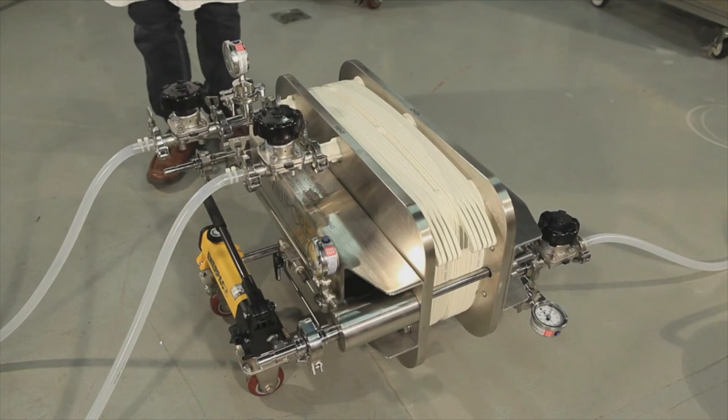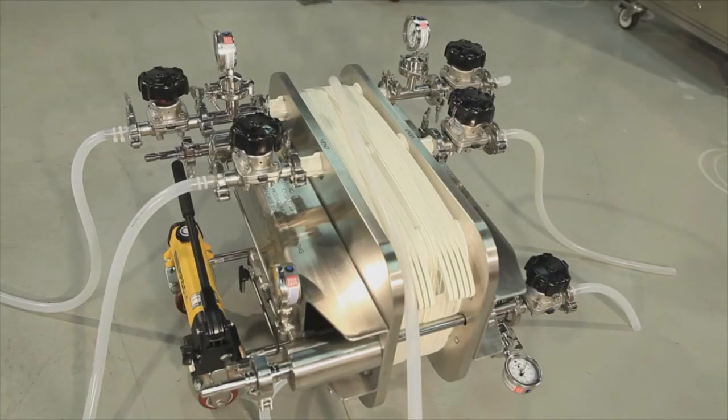We demonstrated installation and operation for primary clarification with one media grade. However, in order to run multiple media grades in the same holder, a diverter plate must be installed, while flow-through adapters need to be used for all feed inlet outlet ports, vent outlet ports, and permeate outlet ports.